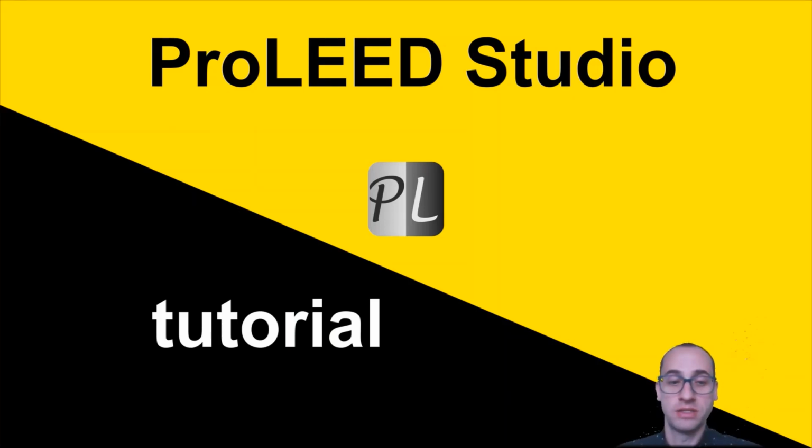I also made the software for simple data export, so you can export ready-to-publish images in both vector and bitmap formats. In this tutorial, I will go through all the ProLEED Studio functionality and 3 experimental examples as fast as possible to make the tutorial shorter.